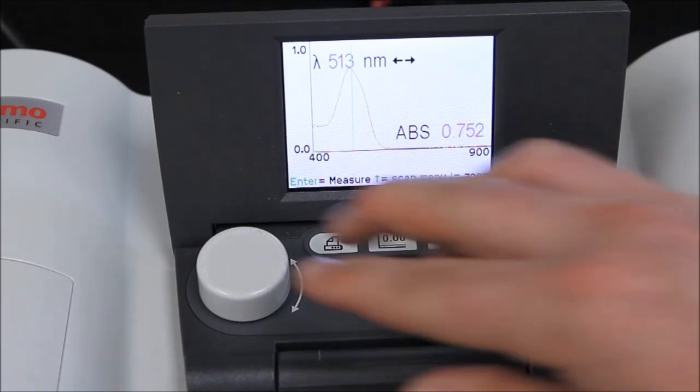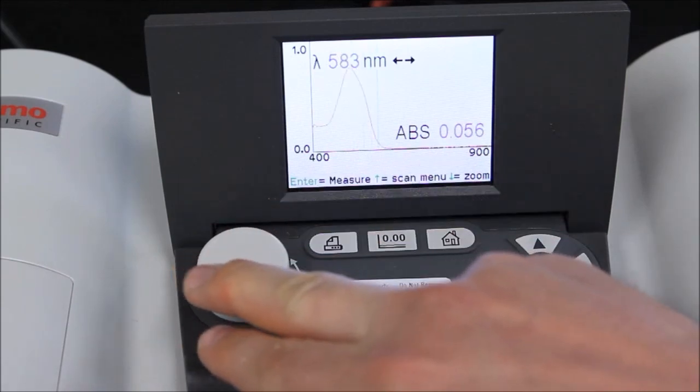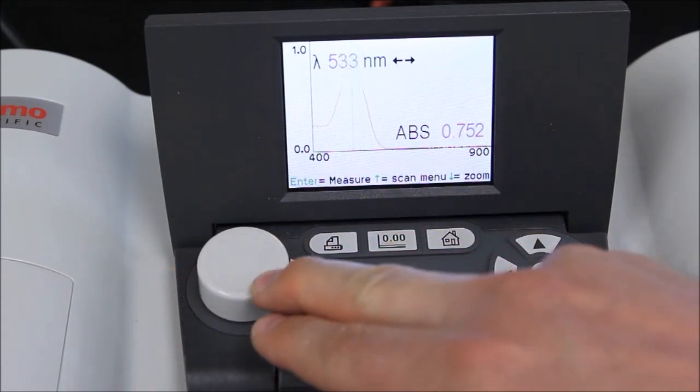When the scan is complete, use the knob to move the vertical line to yield information about the absorbance values at various wavelengths.